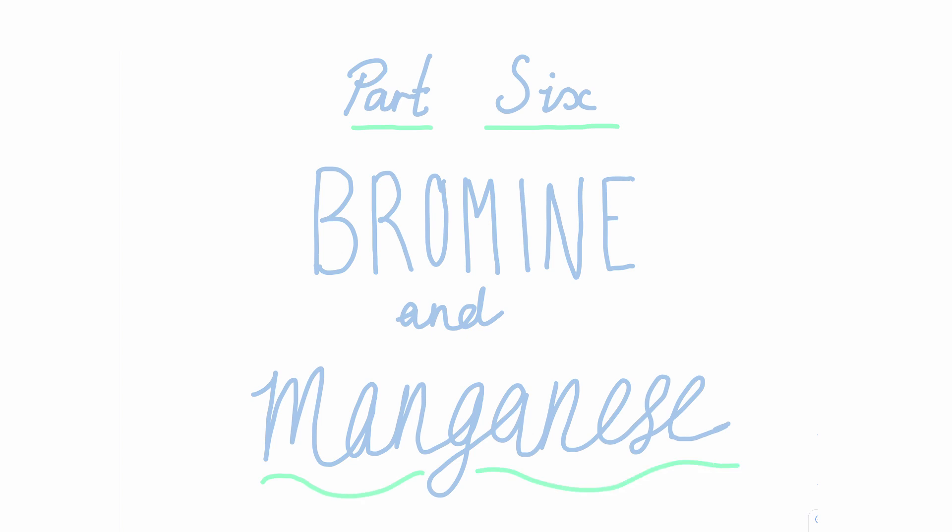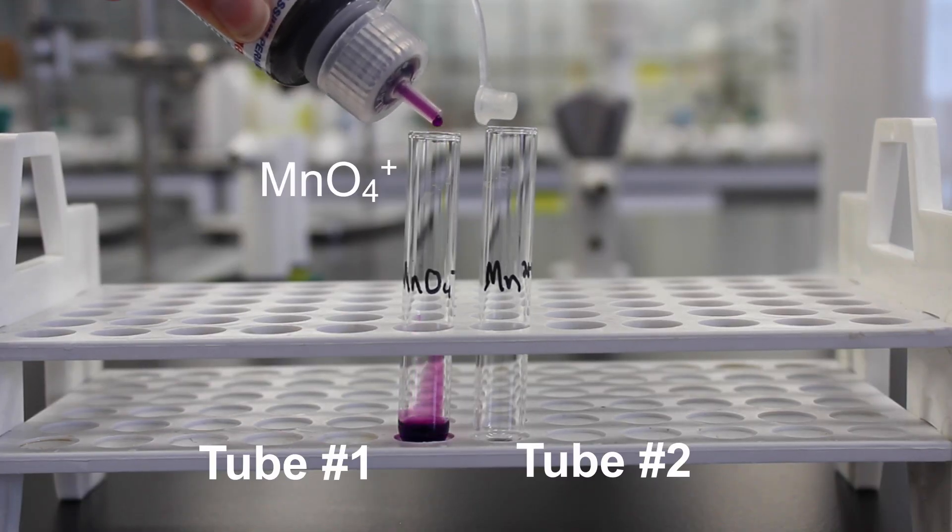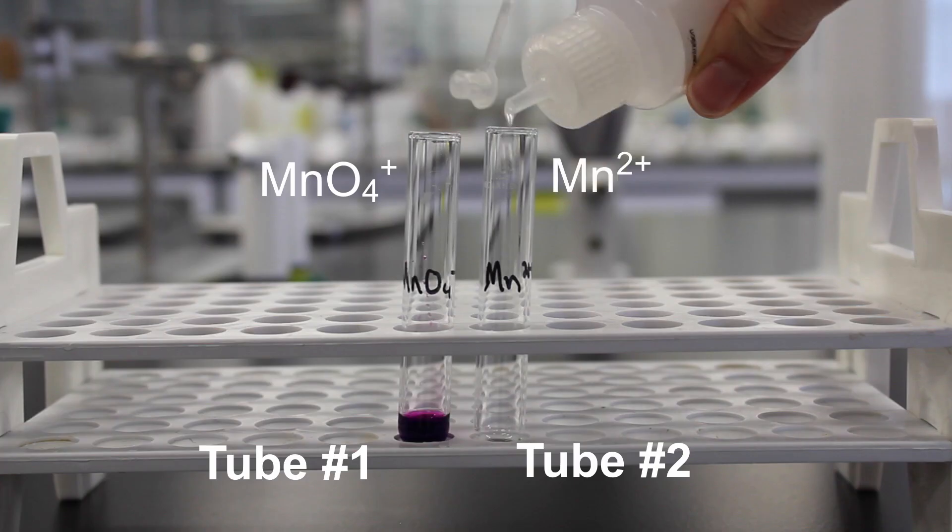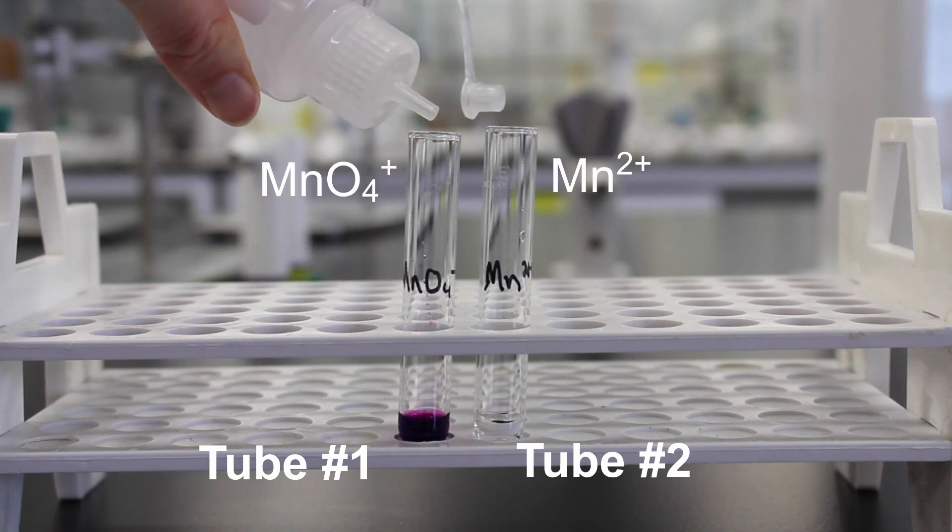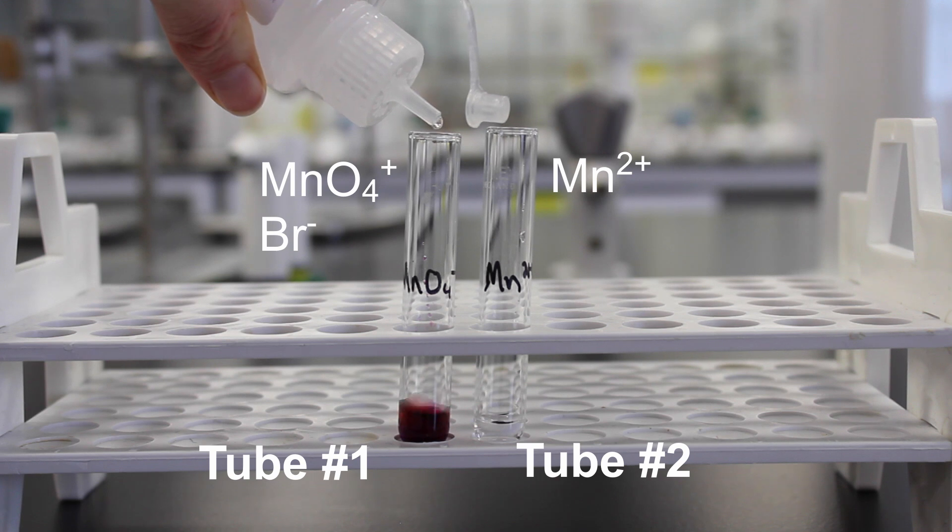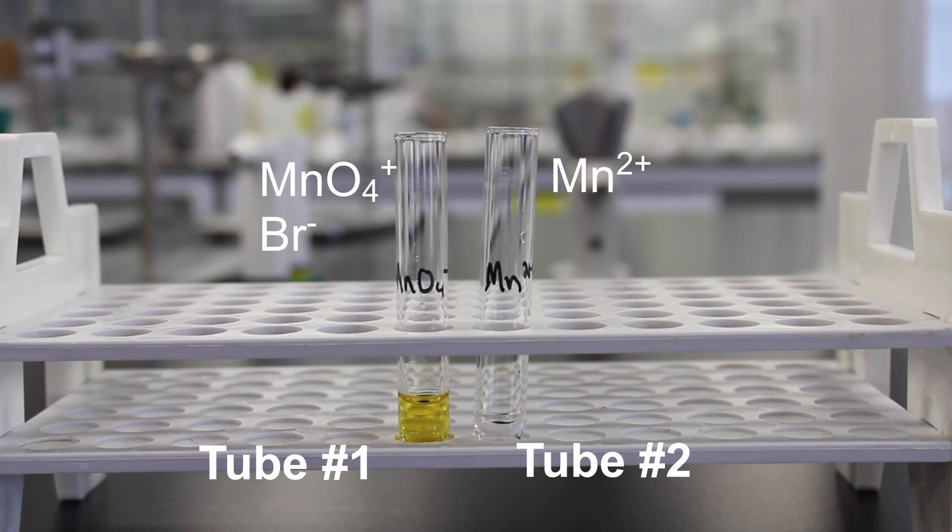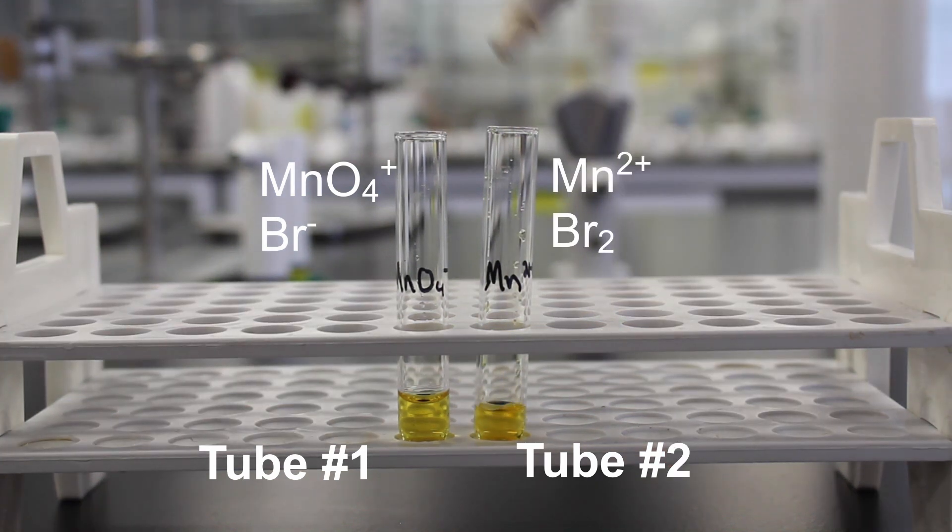Our final experiment today is a comparison of the bromine and manganese couples. Add a few drops of your potassium permanganate to your first test tube. Look how beautiful that purple is. Now add drops of manganese 2+ ions to your second test tube. To each test tube, add the respective appropriate bromine species. This experiment doesn't require the addition of any chemical indicators, because potassium permanganate is a beautiful deep rich purple, while manganese 2+ ions are colourless in solution. Keep in mind that bromine water is orange to begin with.